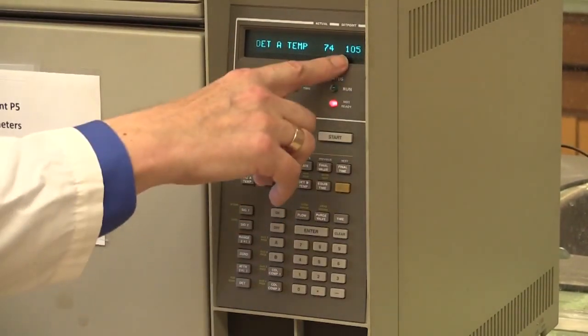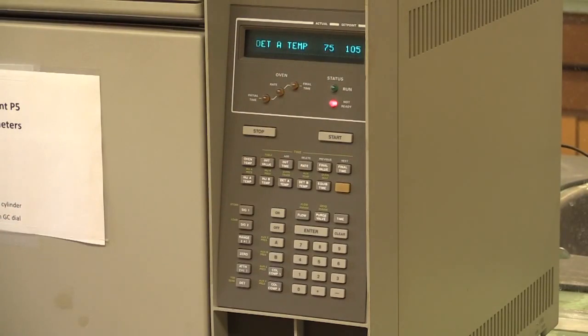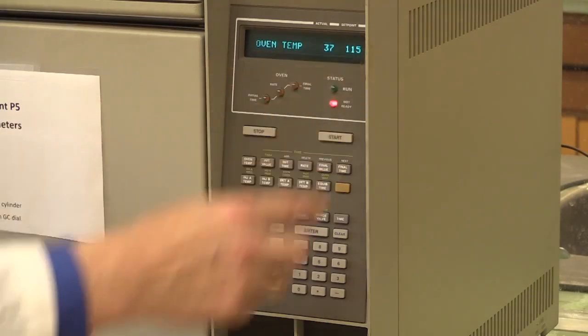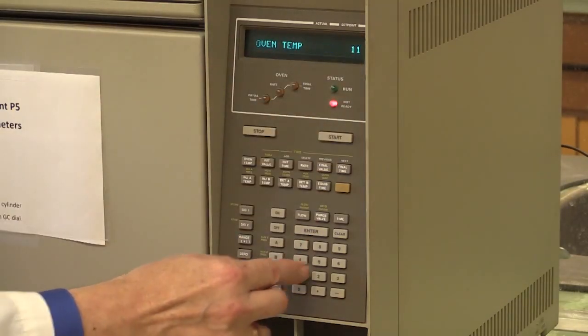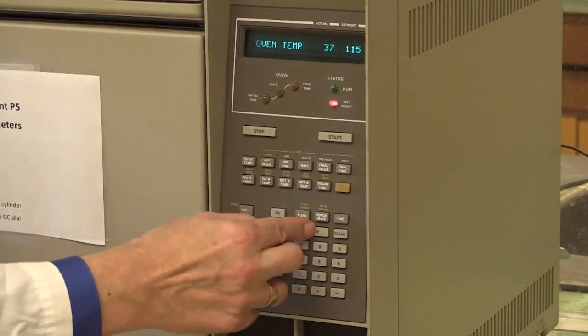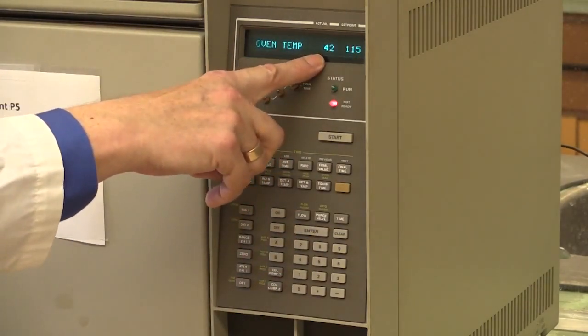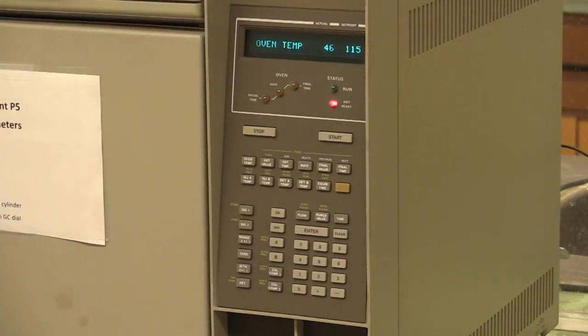The detector is set to 105. It's climbing up from 75 now. The oven temperature is off at the moment, so we set 115, enter. So we've got that temperature, and it's now heating up 40 degrees, 42. So by the time we come to inject, all of this will have equilibrated.